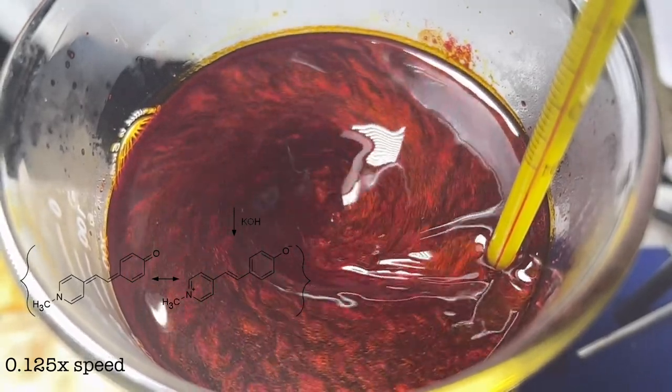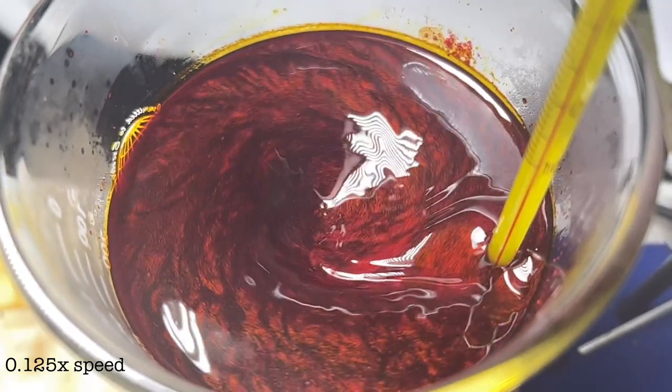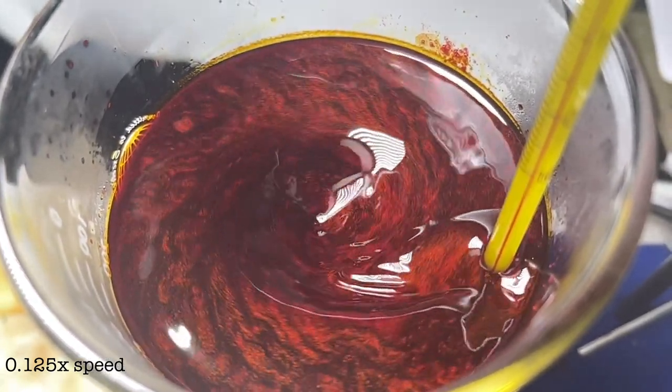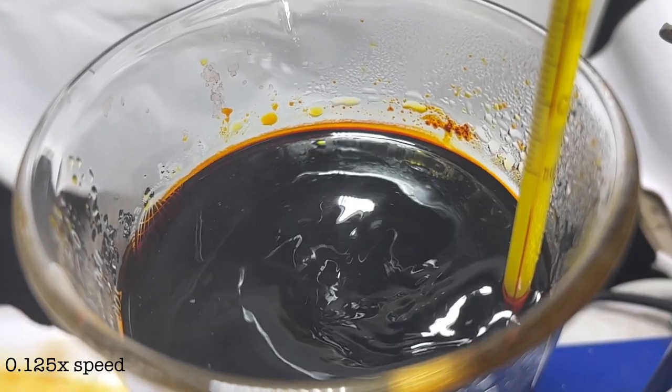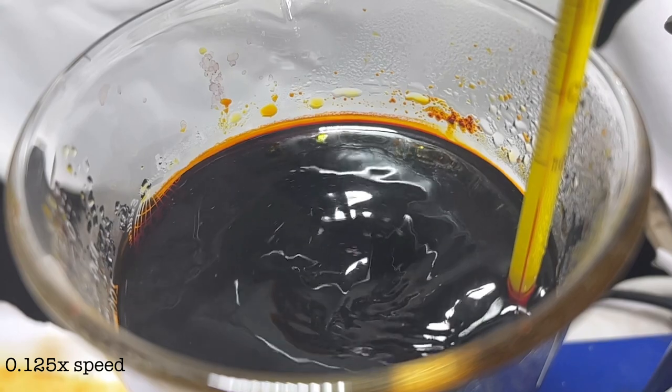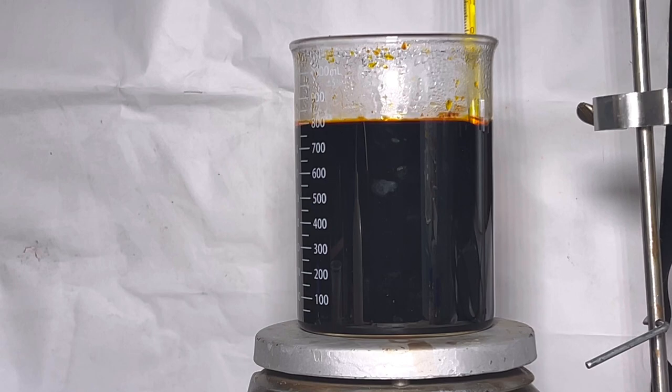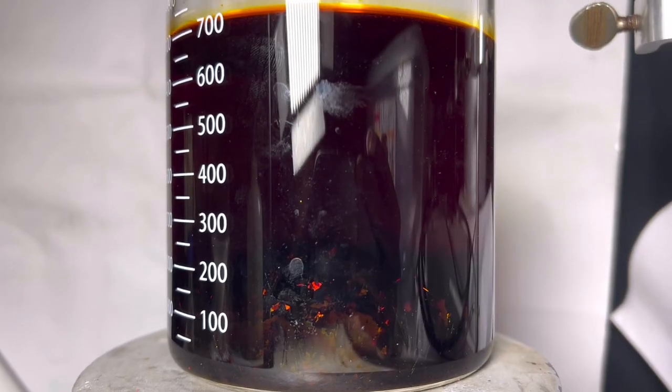While dissolving it created a very nice pattern so I shot a small clip of the video in slow motion. The solution was heated gently but it was not boiled. Once everything is dissolved we get a deep red to almost black colored clear solution. After that the heating was stopped and the beaker was allowed to come down to room temperature.